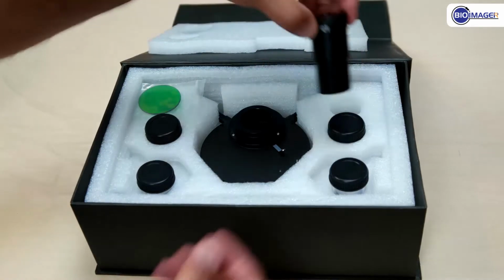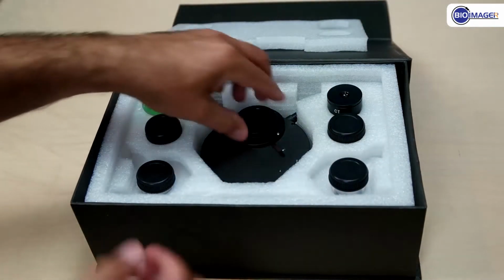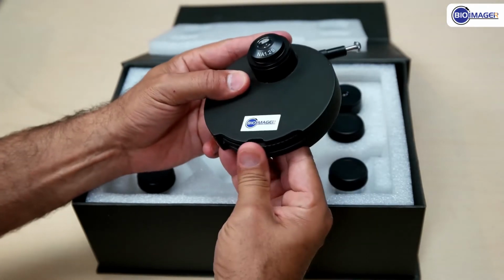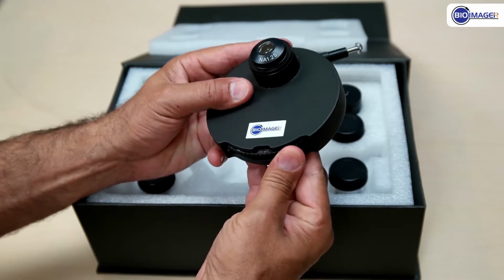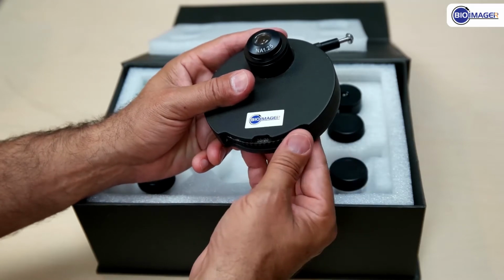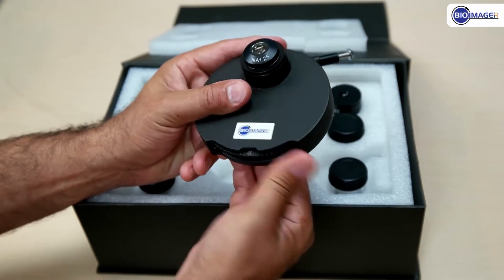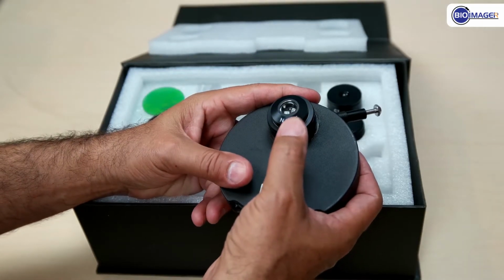The package includes a central telescope for aligning the phase and a green filter, plus a phase contrast condenser turret. With this phase contrast, you can collect the images in the bright field mode and also phase contrast, and depending on the objective lens magnification, you select one of these positions on the turret for 10x or 20x, 40x, 100x, and also you can do dark field imaging. This condenser has 1.25 numerical aperture.